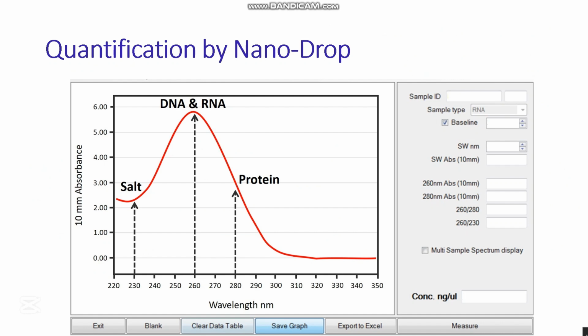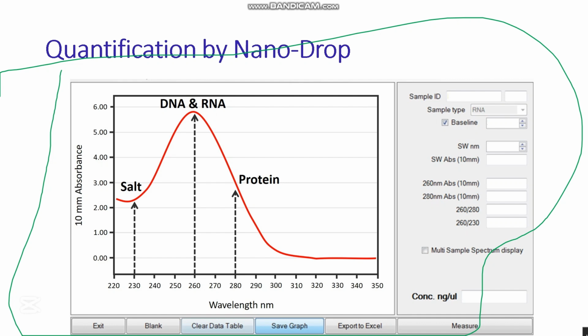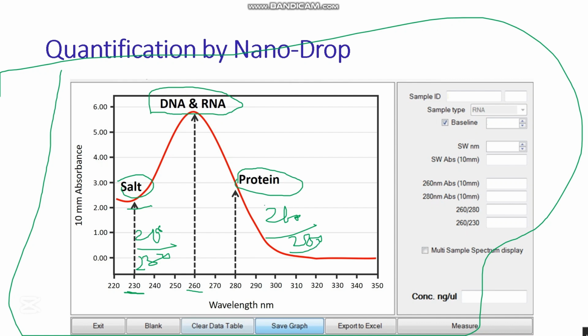And the quantification by NanoDrop, this type of screen we will get. And this type of graph, this peak tells us about the DNA and RNA, and this is about the protein, and this is about the salt. That's 260 by 230, it is about salt contamination, and 260 by 280 is about protein contamination.